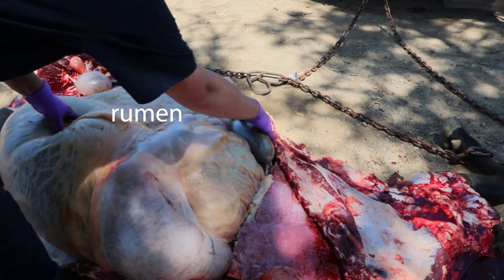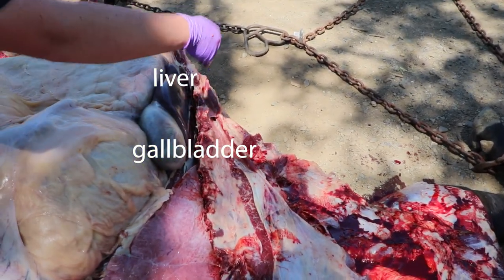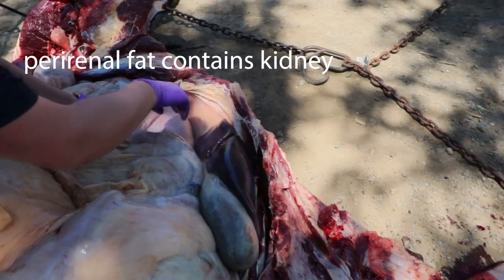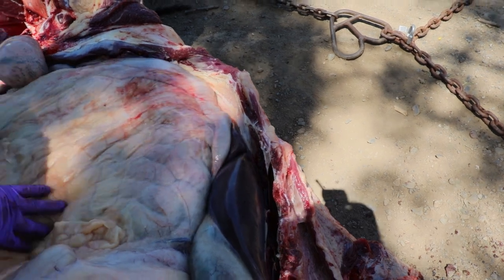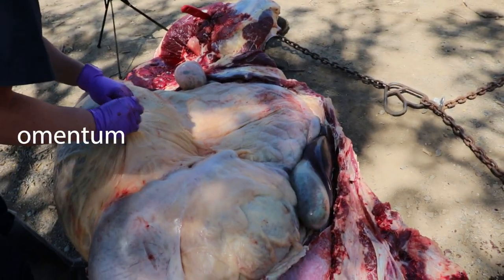You can see the liver and the gallbladder sticking out here. The spleen is tucked down behind here, as is your kidney, which is encompassed in this perirenal fat. A majority of the organs will be covered by this fatty layer of omentum.